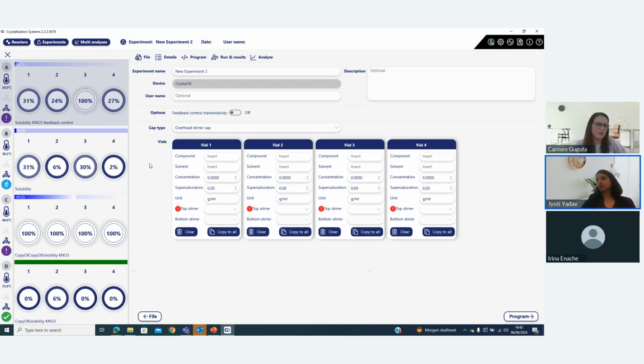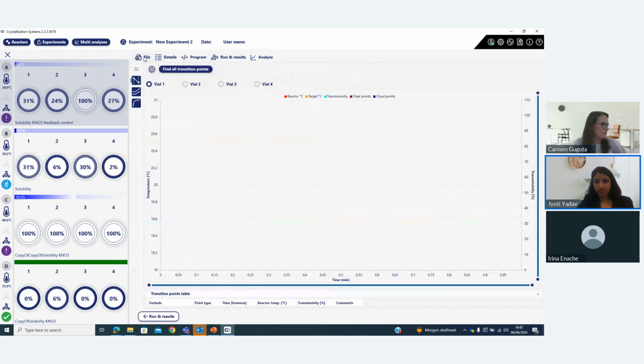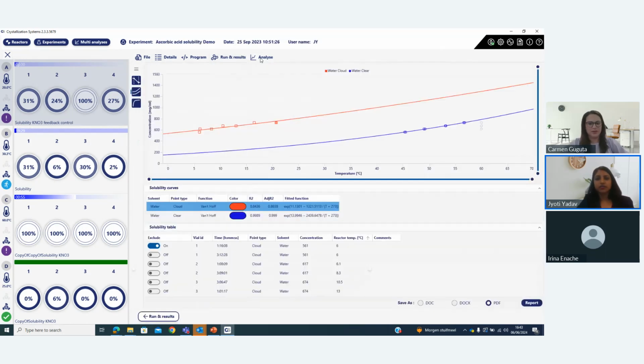Yeah. If you have a problematic compound with very low solubility, you might have to further tailor your experiments. And yes, it also depends upon your R square value. If your R square value is more than 0.9, I think 4 points are sufficient. If your R square value is less than 0.7, you can repeat with more experiments as well.